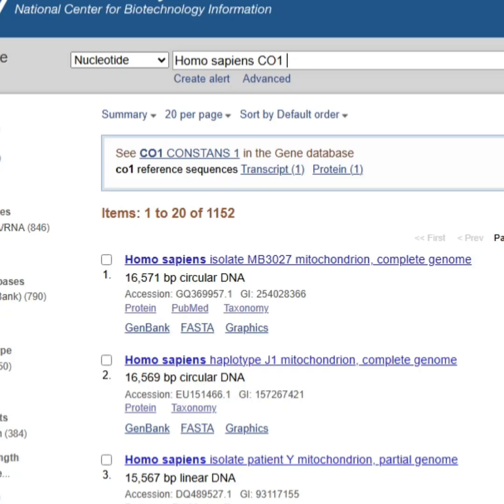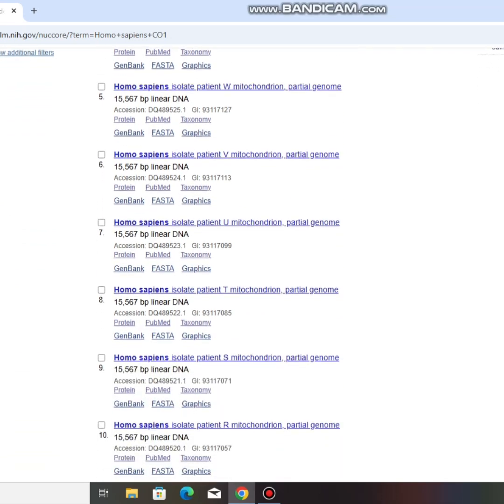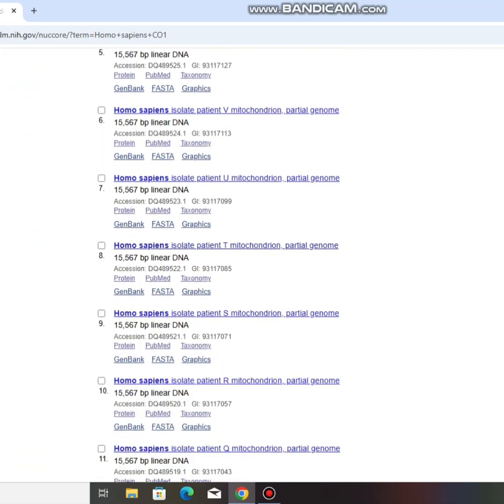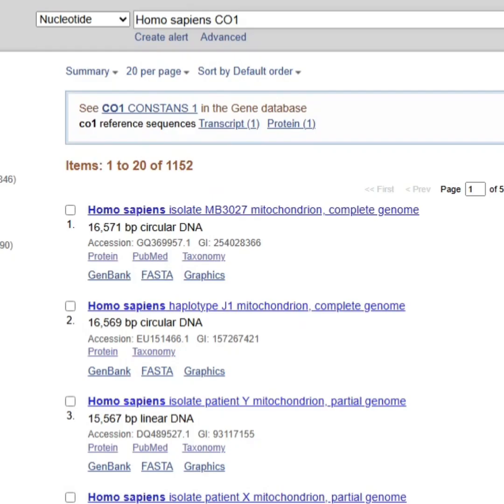Okay, after typing Homo sapiens CO1 gene and we search, you can see the result. There are about 1,152 items found. You can see when you scroll down, you see many genes associated with Homo sapiens. So you can pick any one of your choice. Let's go and pick the first one on the list.